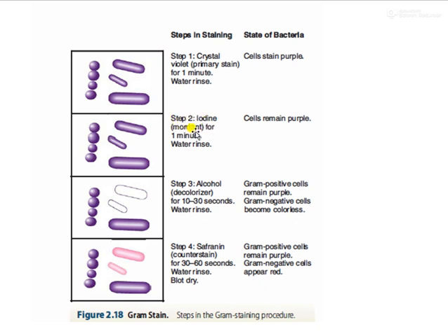Mordant is something which will enable the crystal violet to remain more attached onto the bacterial cell. And you put the Gram's iodine, it is also called Gram's iodine. It serves as a mordant over here, and it is also put for 1 minute, and then again you wash it.